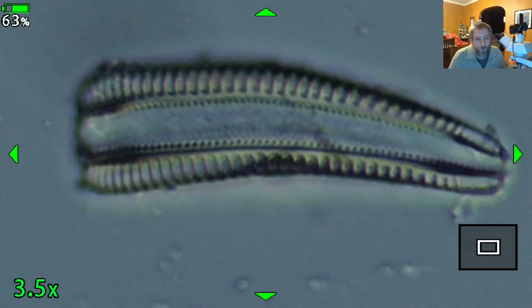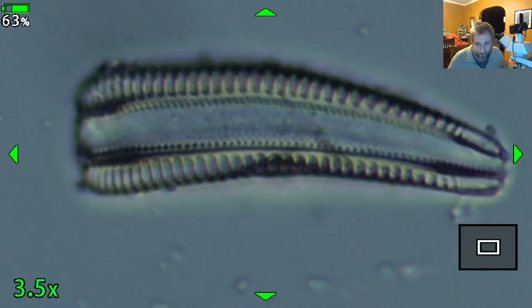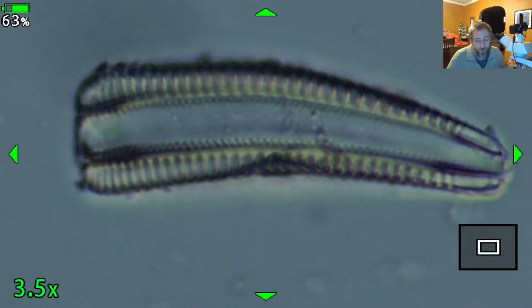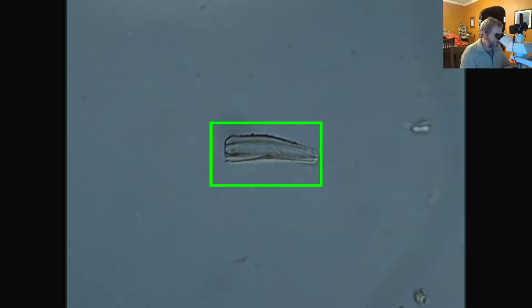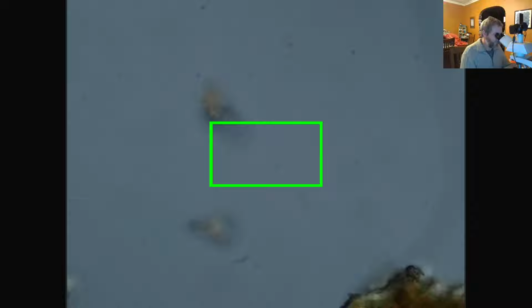I know what it looks like in both valve and girdle view because I'm familiar with it. But you can see that arc shape, and that tells you that it belongs to the genus Rheosphenia. So Rheosphenia is, again, a flowing water indicator. So without any other knowledge of the sample, I've seen two things that indicate flowing water.